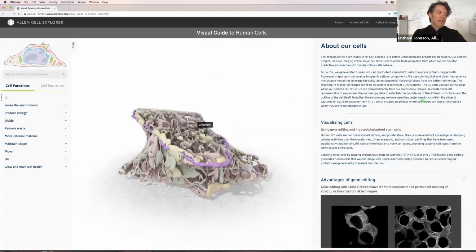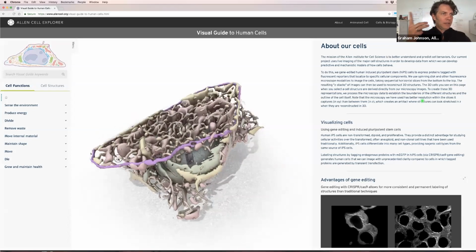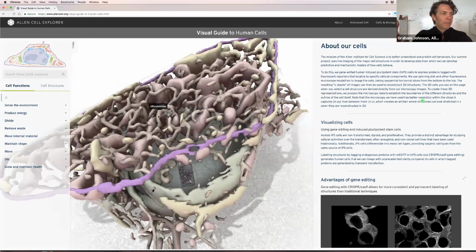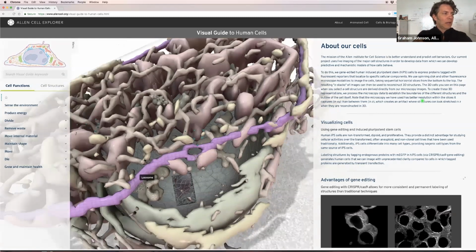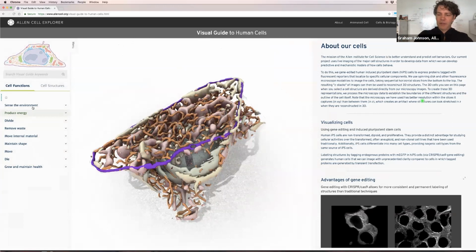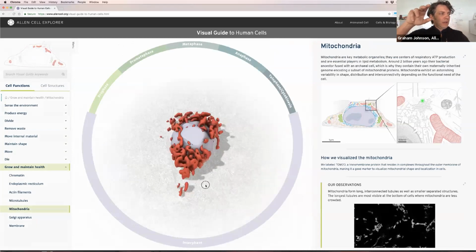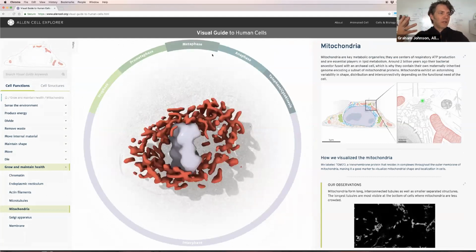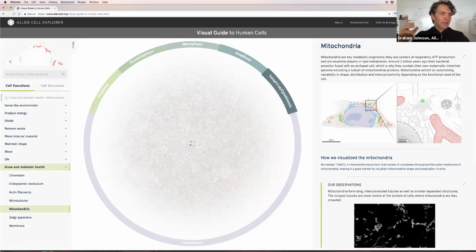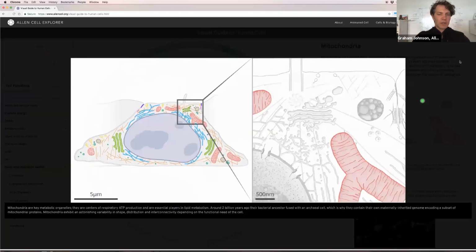So the result of that is we can get, from our raw data, the 3 structures that were labeled, the DNA, the cell membrane, and the GFP tag structure. But we can also use the label-free technology to see 7 other structures or 9 other structures reliably. And then we can model in various well-known components in relationship to those structures. And so with this tool on the website, which is described by the teachers as to how to use it, you can sort the organelles by their functions, and then you read a nice sort of Wikipedia level description of what the function of that organelle is. And you can see the relationship of this zooming image, kind of powers of 10 image, to the organelle structure, the whole cell structure, and the protein structure on the right.